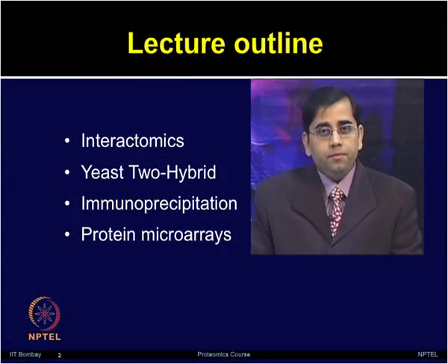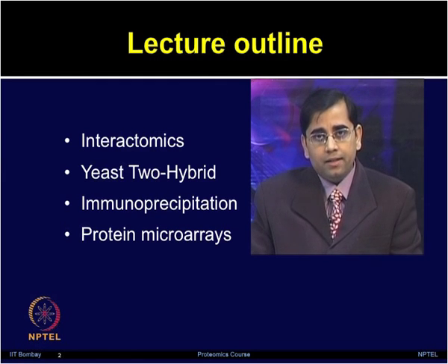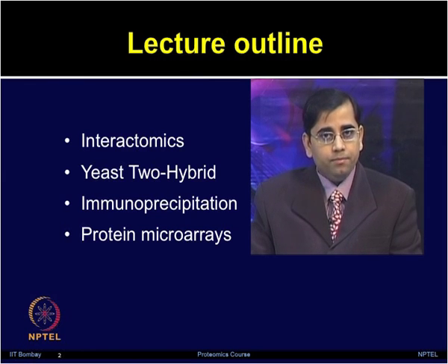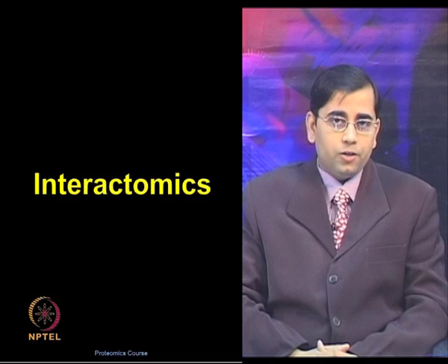So, in today's lecture, we will discuss what interactomics is, different ways of studying interactions such as yeast two-hybrid, immunoprecipitation, and then we will move on to the high throughput approaches such as protein microarrays. So, let us first start with interactomics.